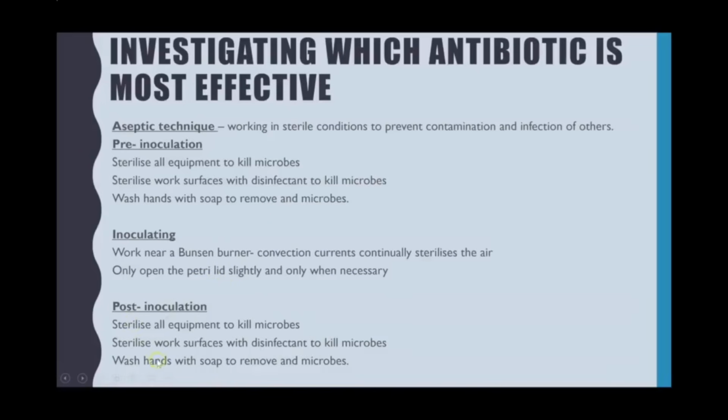So post-inoculation is then exactly the same as pre. You then have to sterilise all your equipment again because you've deliberately had it touch an E. coli, sterilise the work surfaces with disinfectant, and wash your hands again.